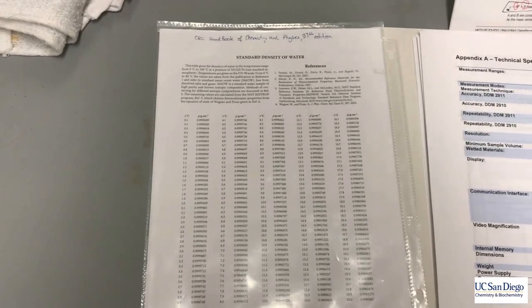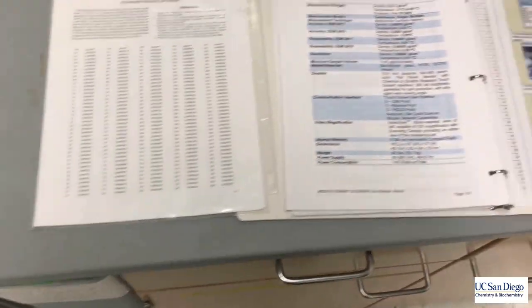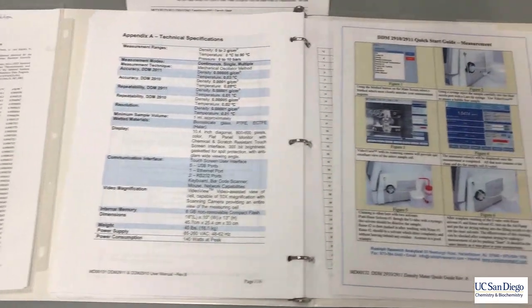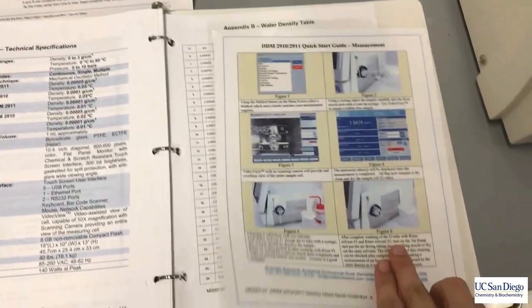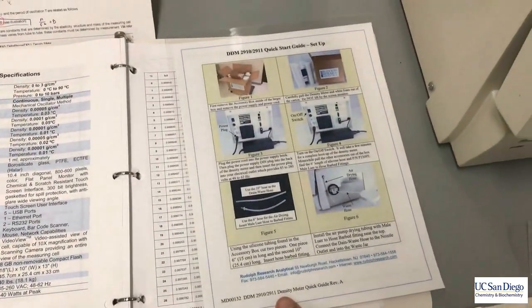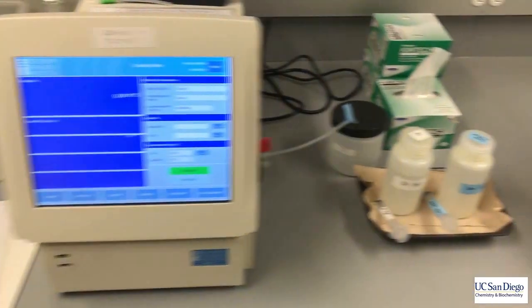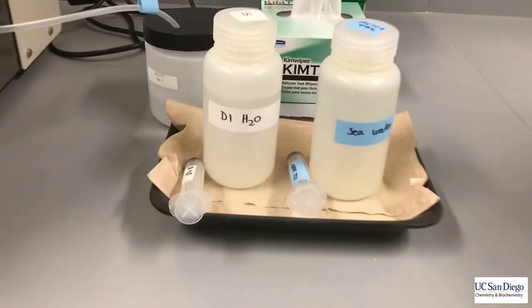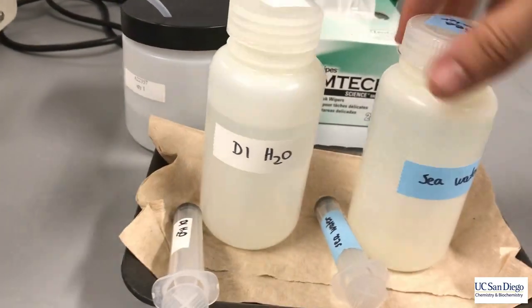We'll also need a CRC handbook list of densities for DI water. Here is some technical data about the instrument as well as written instructions. On the right side of the instrument you'll find DI water and sea water.